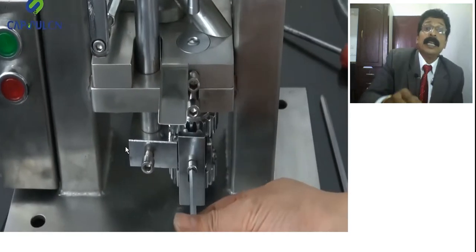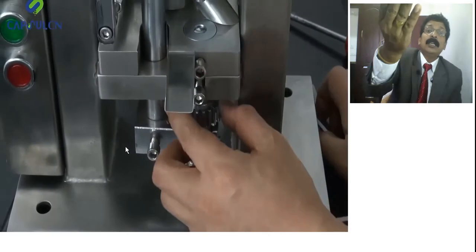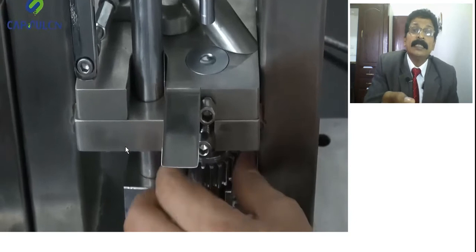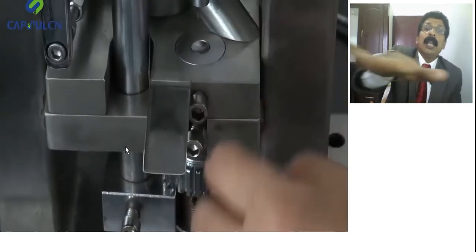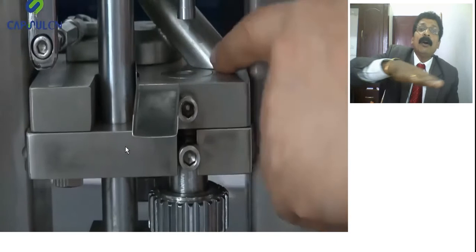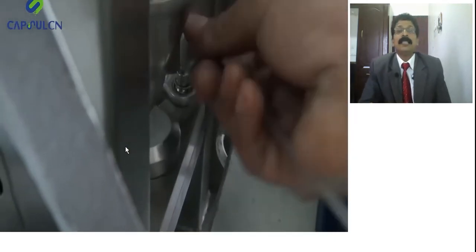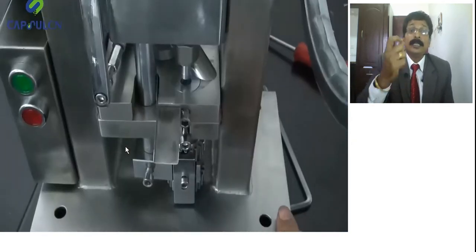Ejection: after compression, the tablet should be ejected up to the level of the die. That is why, see, he is adjusting the lower punch to the level of the die. He is putting his finger to show you that it should be level with the die, so that the tablet will be ejected. So ejection is now fixed, and he is tightening the screw so it stays in the same position.